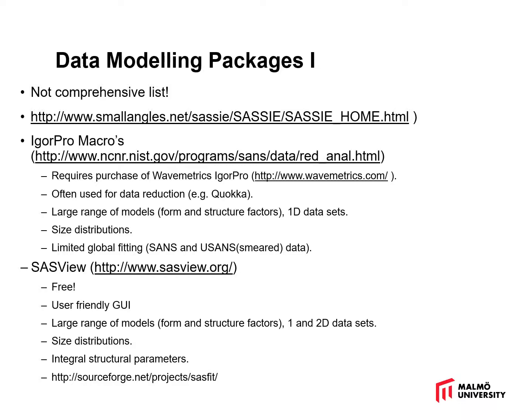So I'll give you a brief overview of the data modeling packages that are available. They're all pretty much the same. They just implement the approach slightly differently. There's a bit of a list there in the first link if you want to go and have a look. There's rather a lot of modeling macros available for Igor Pro, and we also use this for data reduction, so it's quite useful. One of the more common packages is SasView, which is free.